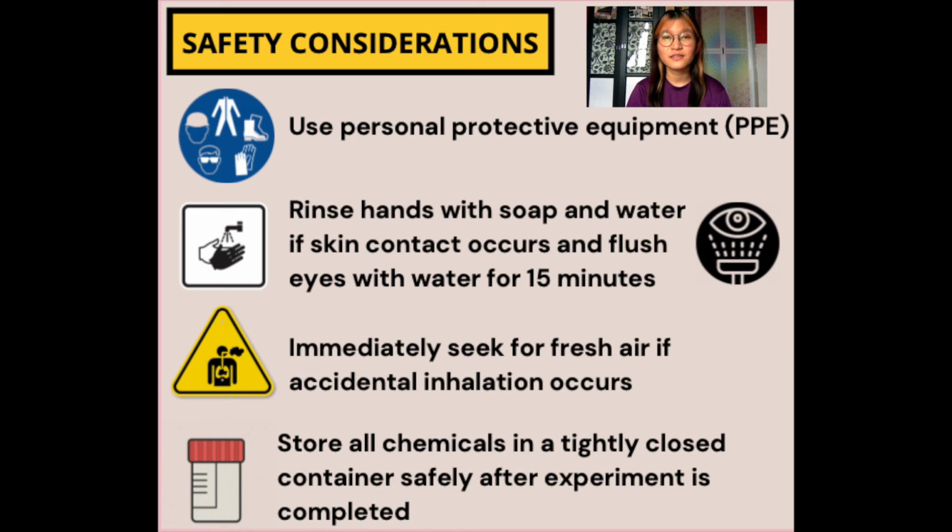The second safety consideration is to rinse our hands with soap and water if any skin contact with the chemicals occurs. We also need to flush our eyes with water for about 15 minutes if any chemicals get into our eyes. Thirdly, we need to immediately seek fresh air if we accidentally inhale any kind of chemicals. Last but not least, we need to store the chemicals in a tightly closed container safely after conducting the experiment.